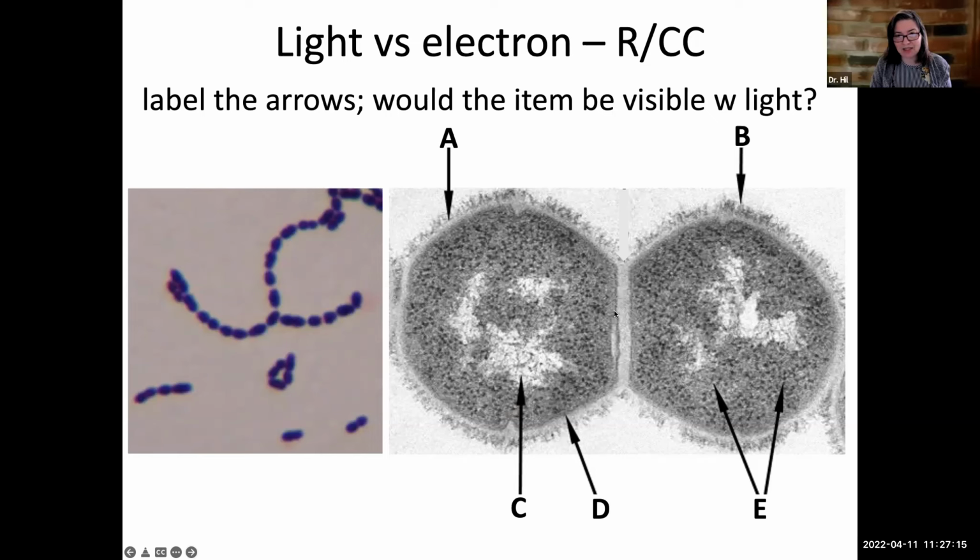And it's amazing that, it's not really easy to see, but an electron microscope will allow you to see where it is. C is the nucleoid. It's this region where the chromatin is kind of just piled up inside the cell. And E is ribosomes, the little dark spots.